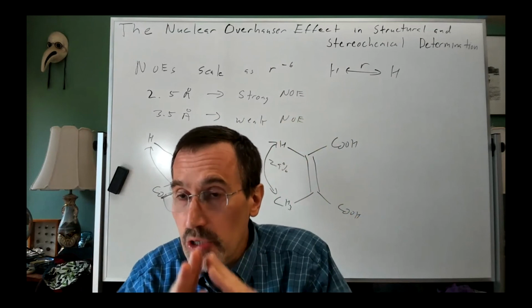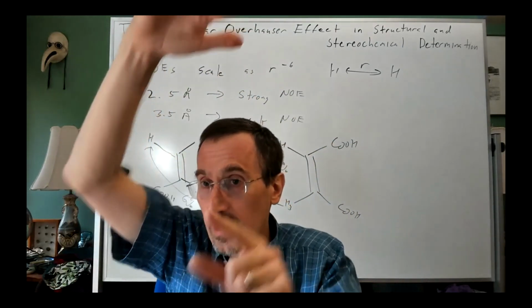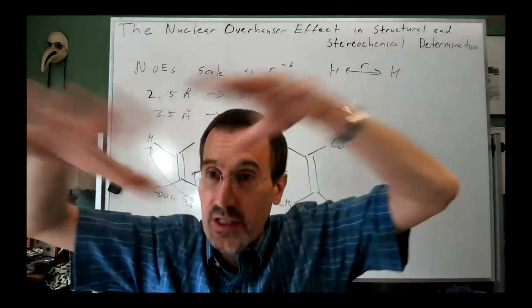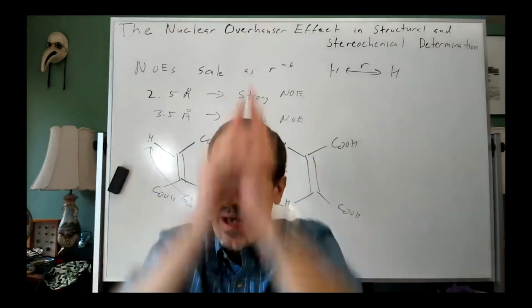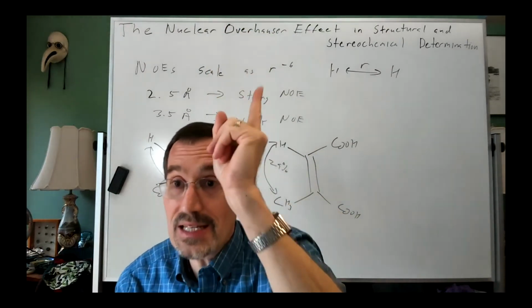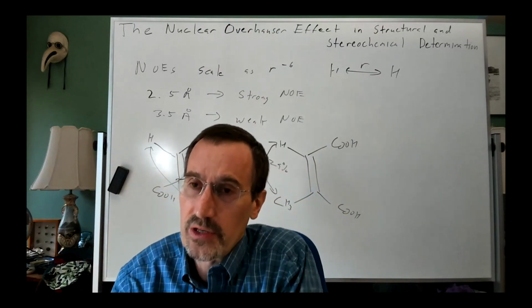Now, the problem in a 2D spectrum is that a very tall spiky peak goes up very high on the topographical map compared to a broad fat peak, but a broad fat peak may have the same volume. In other words, a big hill might have the same volume as a spiky little peak, but the spiky peak is going to show up more in the contour plot. So it's easy to fool yourself, particularly in the NOESY spectrum. So usually I have to be really careful in interpreting things.